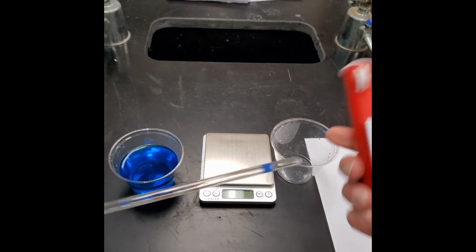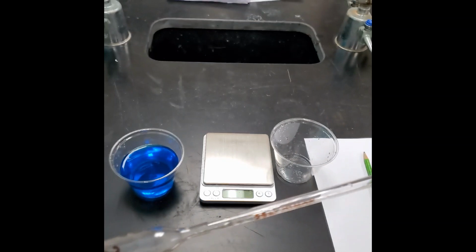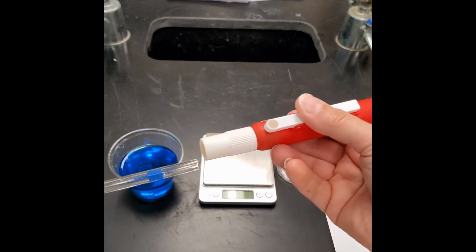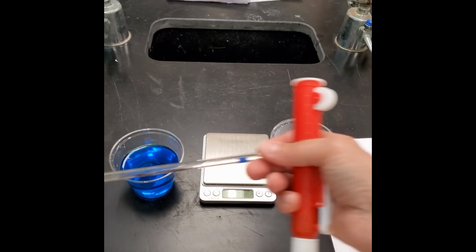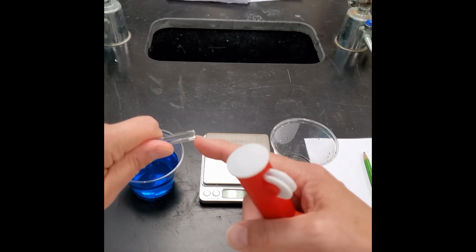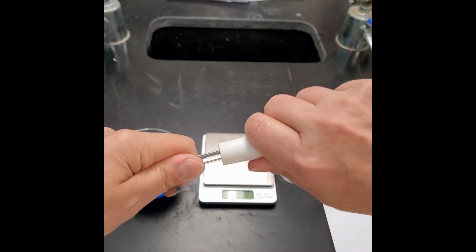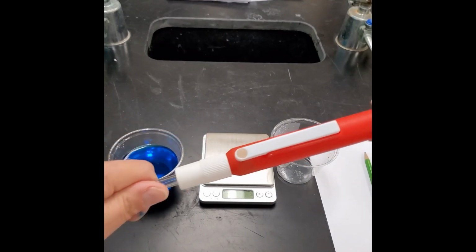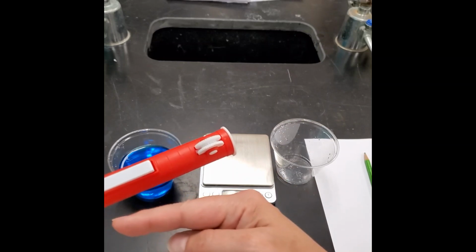Also, when you go to put the filler on, it goes on the flat end, not on the pointed end. Okay, and you don't hold it way down here and put the filler on up here, because it acts like a lever and it can snap in your hand. You always want to hold the pipette as close to the top as possible, and then you put the filler on it. Do not jam it on, just push it on so that it's snug. Okay, when you have it on there, this part right here should be all the way down.